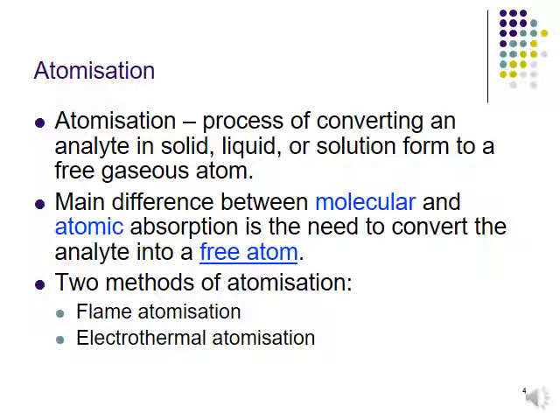This kind of instrument will atomize our analytes and other components in the matrix to become atoms, or free gaseous atoms. Basically all of the samples are commonly in liquid form, so from the liquid form it will change to the gaseous phase. This is what we call atomization.